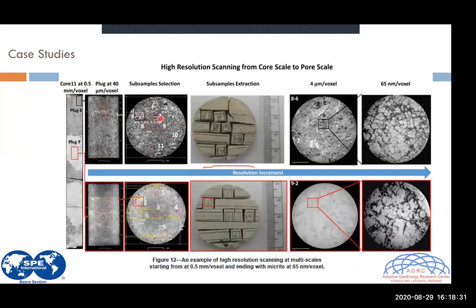as I mentioned before, the selection of different regions based on the previous analysis of your CT images, and then you can cut your sample in different volumes and perform the high resolution acquisition in each one of them. Okay, if you identified in your previous wafer some different regions, some different characteristics, select several samples to perform this kind of high resolution analysis.